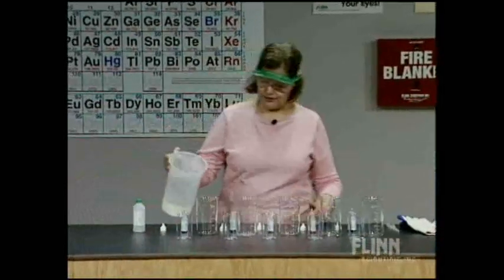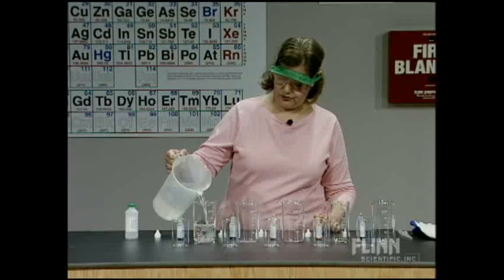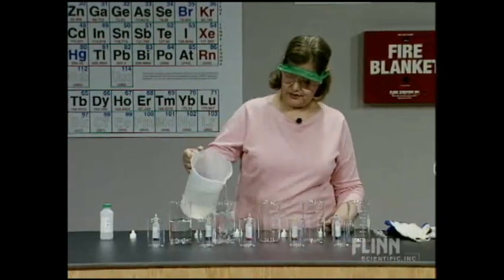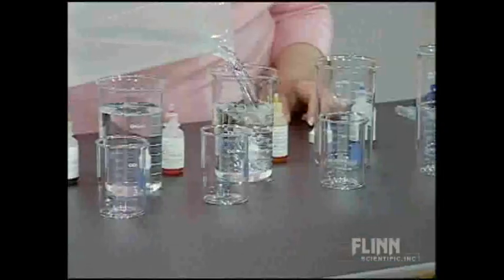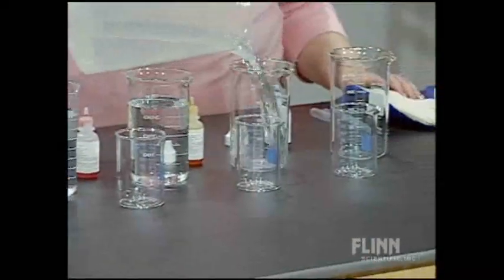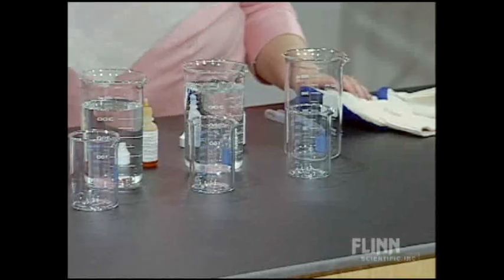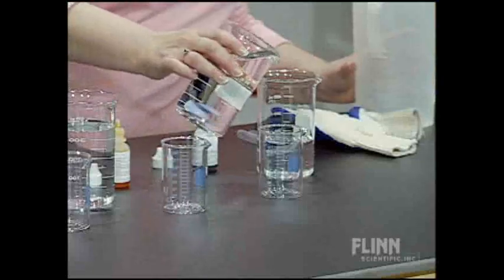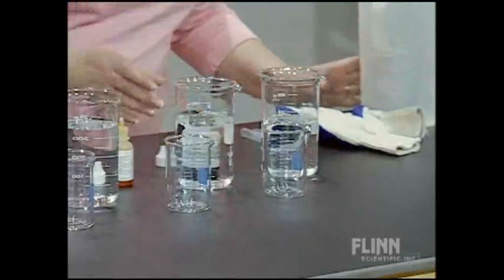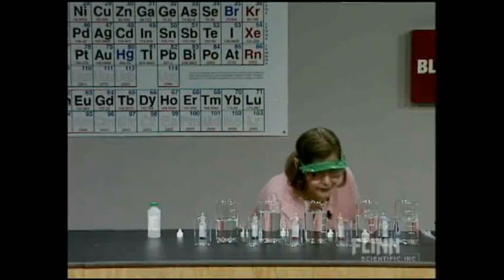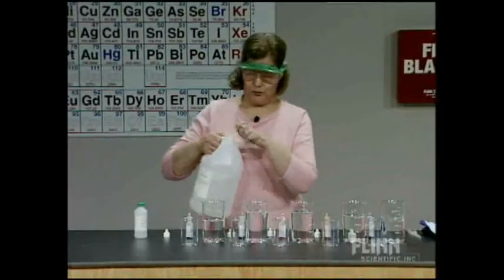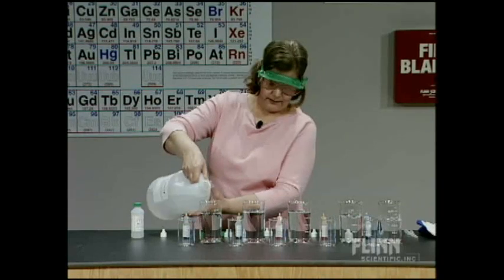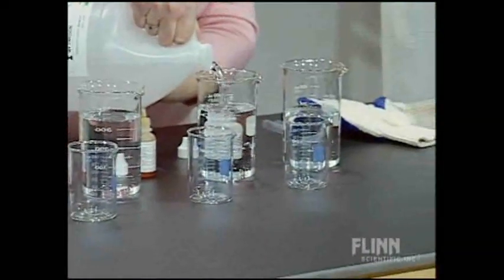I'm simply going to start by adding water to each of my beakers here. The exact amount is not important. This is distilled water. I'm going to add about 400 milliliters to each. I've got some extra distilled water here, and I do want to make them about equal. I've got about 400 milliliters of water in each.